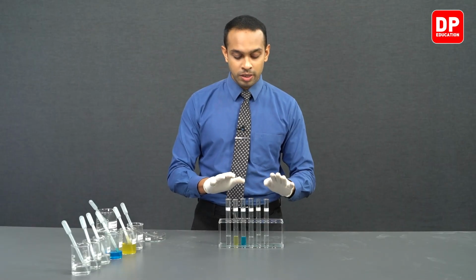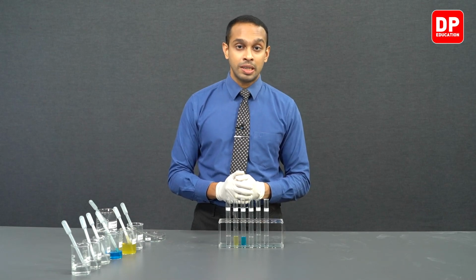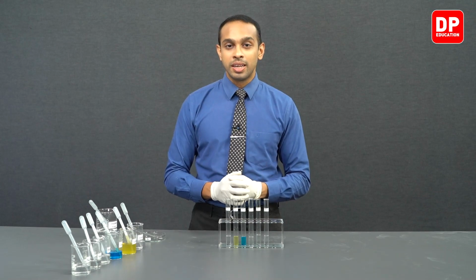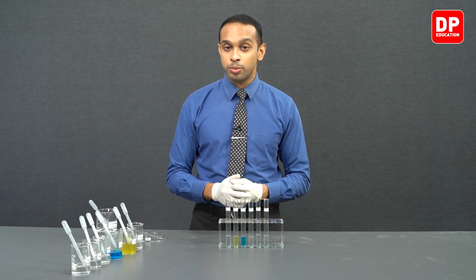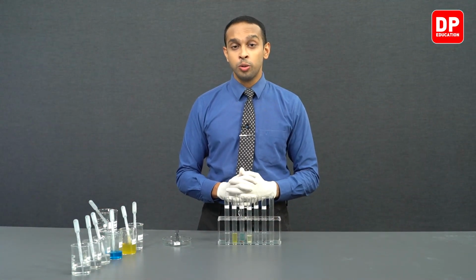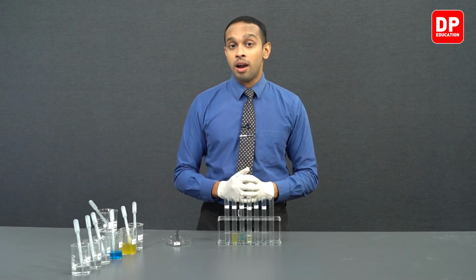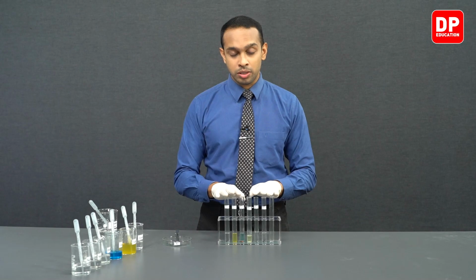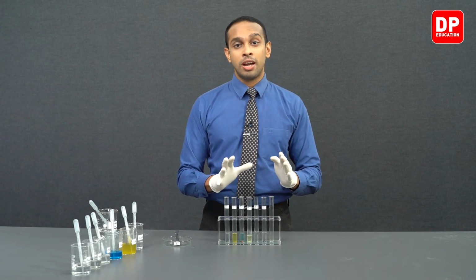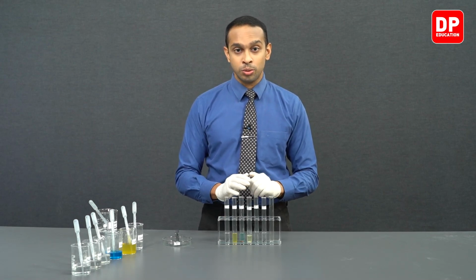So students, we will now allow this to react for a period of time, and after we have observed noticeable changes, we will come back and talk about the observations we have here. Students, now we join you after we allowed all of these solutions to react with the iron metal piece that we added into each of these solutions. So now let's observe which solutions actually have reacted with the iron metal piece.